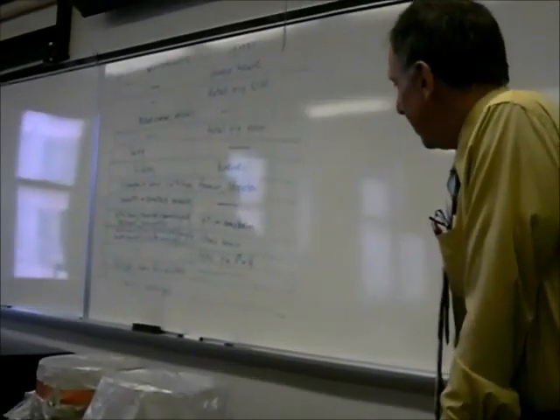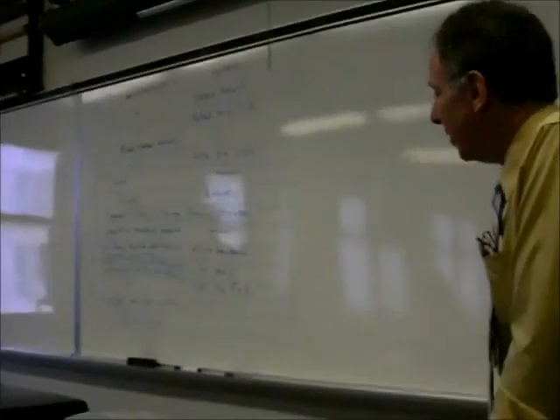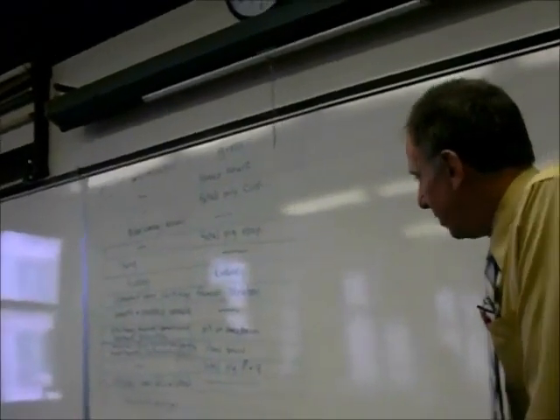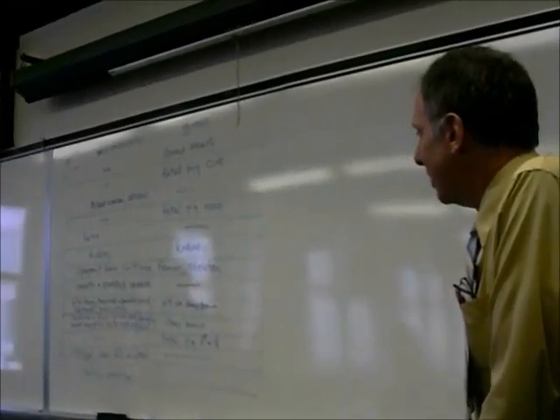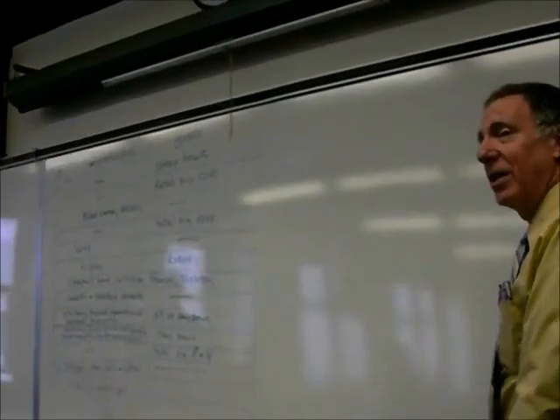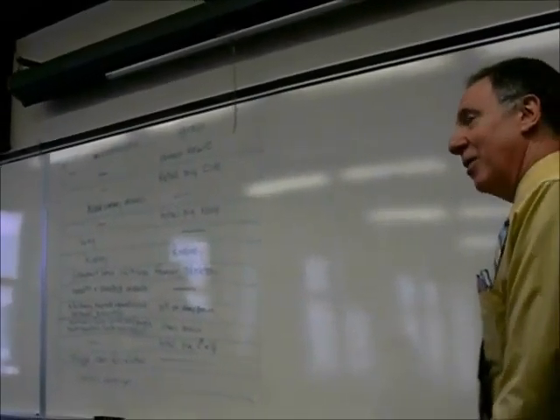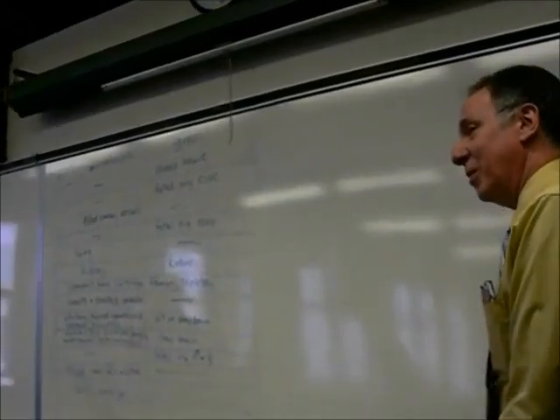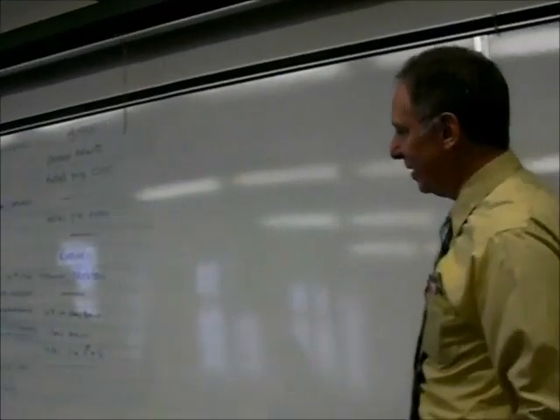Number 18, we have endocrine slides: the pituitary, the thyroid, parathyroid, the adrenal, and the pancreas. Now you notice I have something on the gross side, and that is, you remember in the sheep brain, the pituitary gland is visible. So that's on the brain specimen. You should be able to recognize the pituitary gland. So I guess that's technically a chapter 18 item.